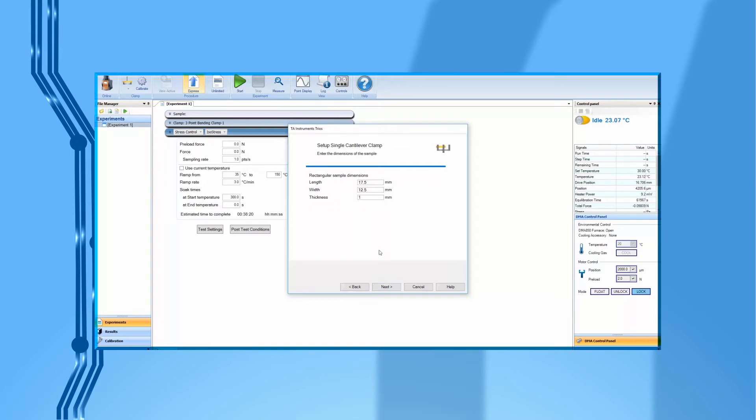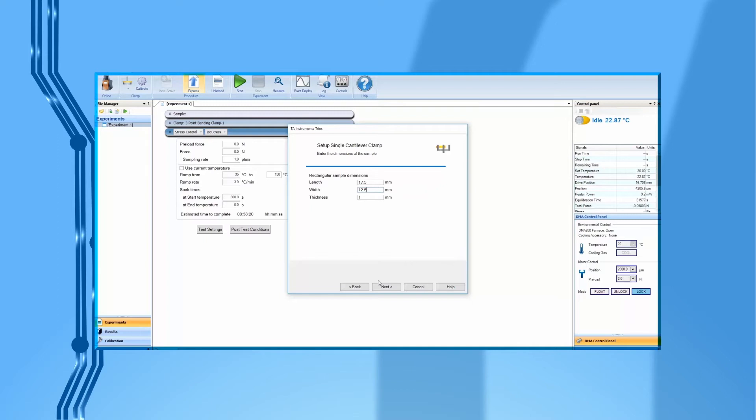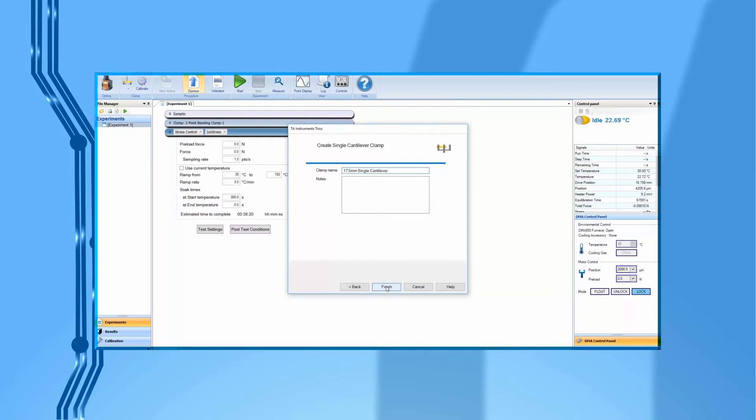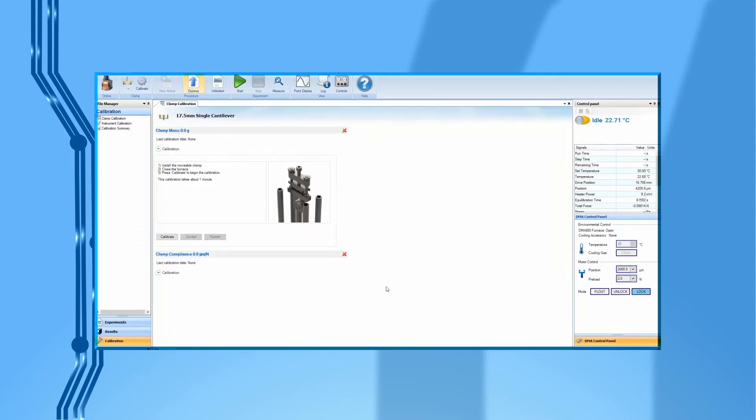In this video, we will use the 17.5 mm single cantilever clamp as an example. So under Clamp Sample Dimension, enter 17.5 mm as sample length. We can leave the sample width and thickness as default for now, since we'll be measuring and entering those values when testing each individual sample. Specify the name of this clamp by entering 17.5 mm single cantilever. Click on Finish to create this clamp file.